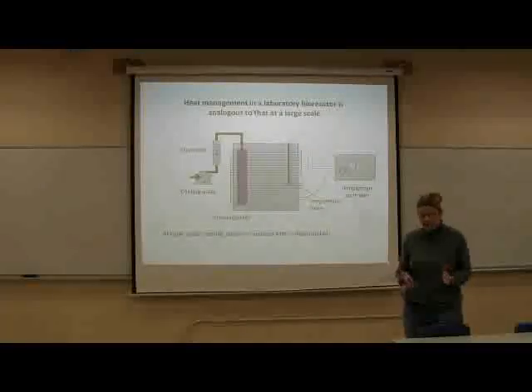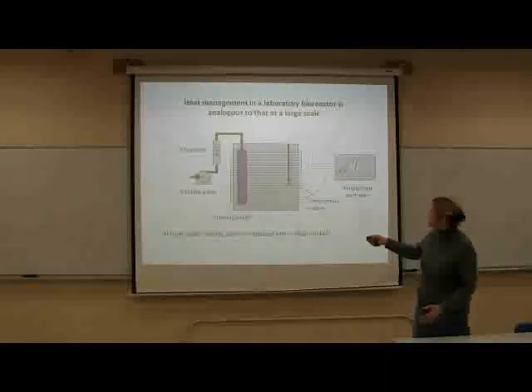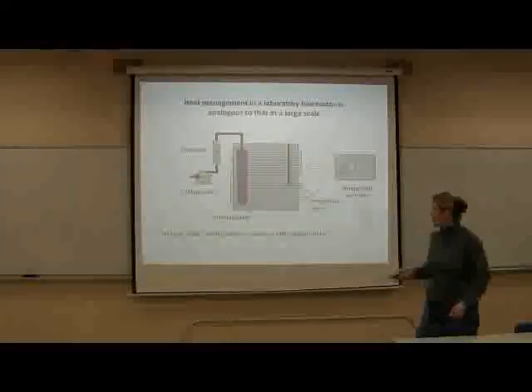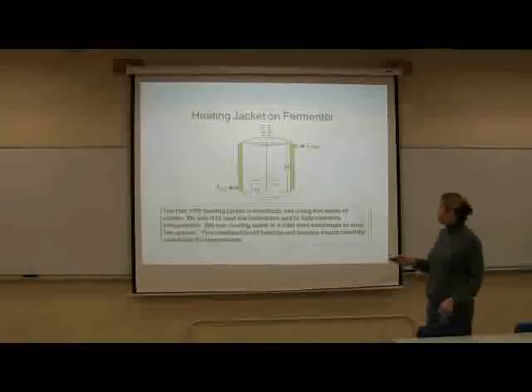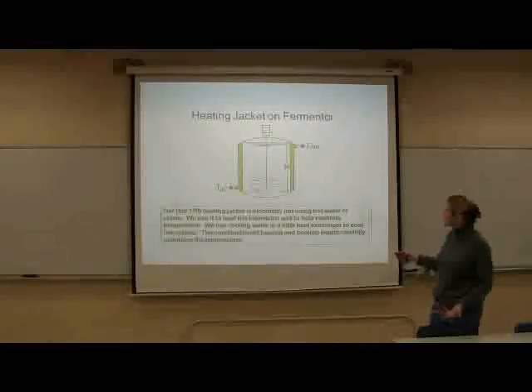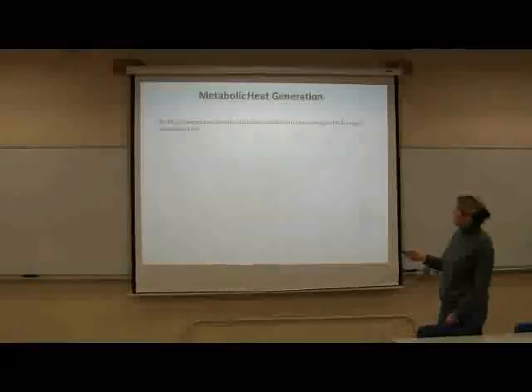It's a small bioreactor, so if we put cold water into that little heat exchanger, we flow water in and flow water out, and we're going to circulate it. And that will be between this cooling and the jacket heating, we will keep our bioreactor at the proper temperature. And we use an electrical heating jacket, not a steam jacket, but this is something like what you would use in a large-scale bioreactor.